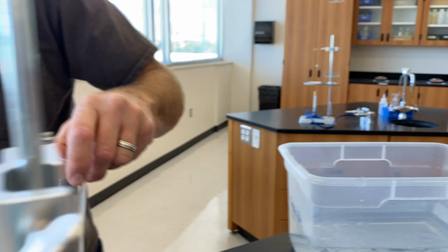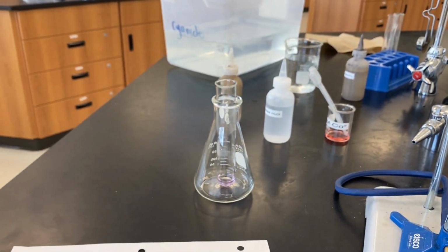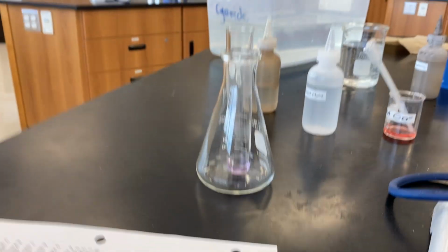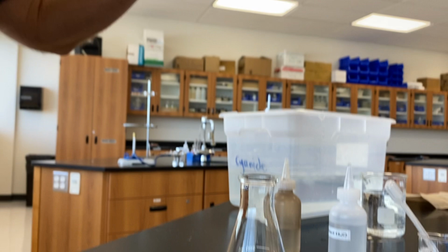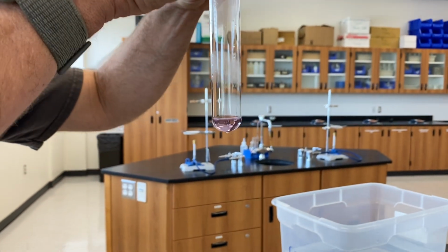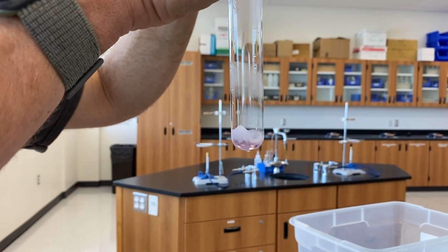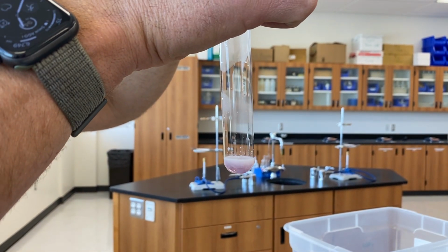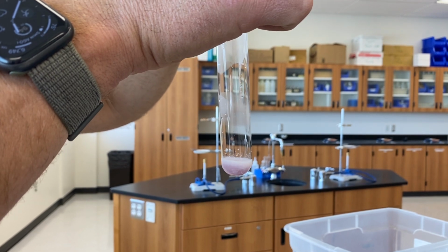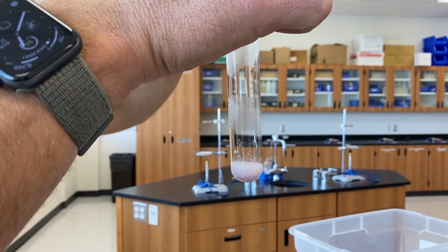And now for our last step, in step 10, once it's cooled, it's now back to purple. We're now going to add 10 drops of silver nitrate to this. So 1, 2, 3, 4, 5, 6, 7, 8, 10.